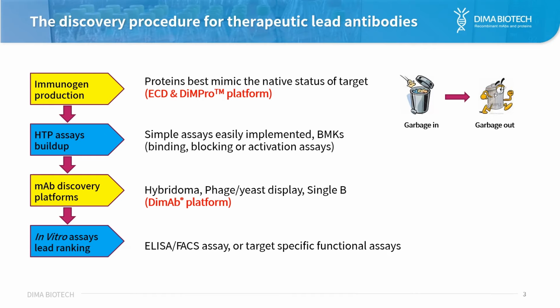The final step of the discovery is to use the in vitro assay to find the best performed lead molecule for the downstream in vivo study. For today's talk, I will focus on the first and the third step of this process.